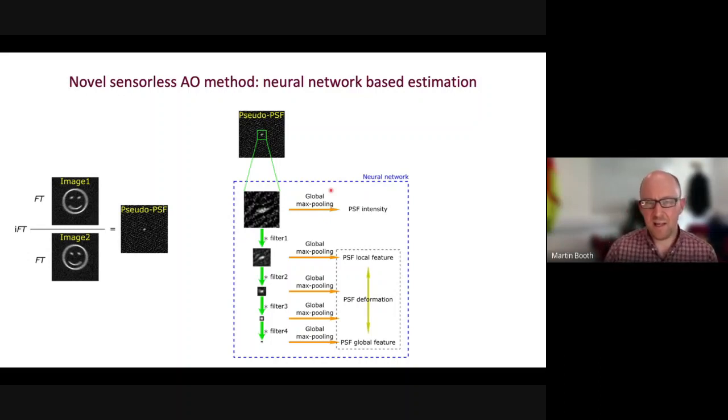And then we designed a particular type of neural network, which was based around another piece of physical knowledge we have about this system. This is similar to what we saw in the Wavelet transform earlier, where I said we know that we have different scales of aberrations, and that different features of the image will be affected differently by different sizes of aberrations. This is effectively how this neural network has been structured, because by using certain convolutional filters, we can treat different parts of the network as accessing different scales of the image.